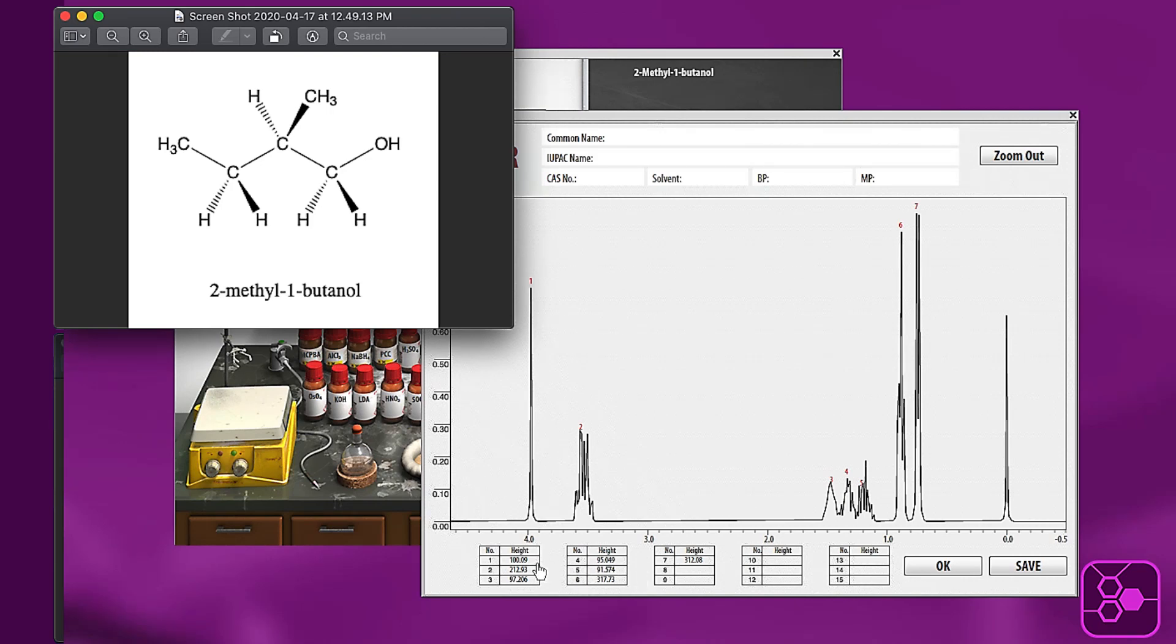And if you sum those together, you have one, two, three, four, five, six, plus three is nine, plus three is 12. So that's all of our protons accounted for right there.